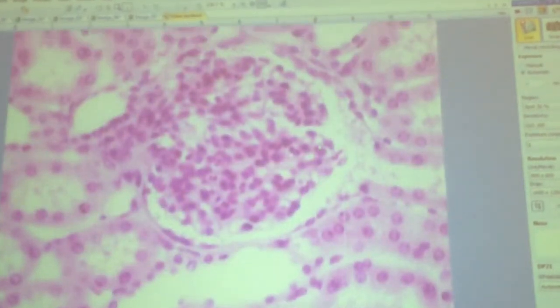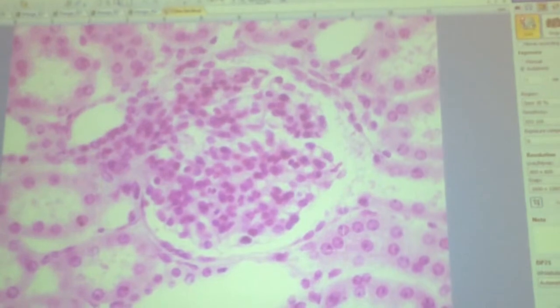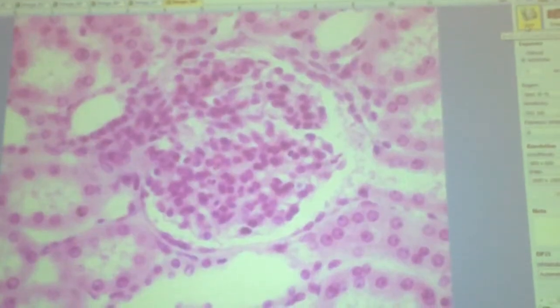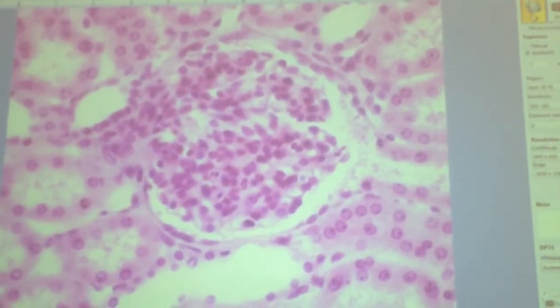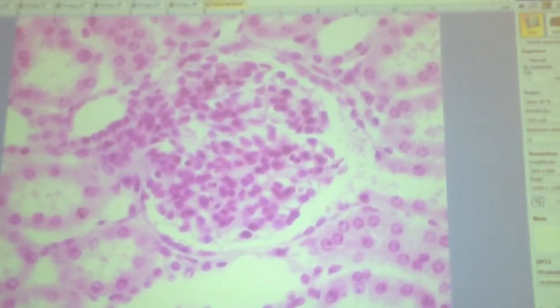Oh, here's another really good one. Yeah, this one's really good. I'll take it. Oh, Yanni, this is exciting stuff. These little glomeruli are working hard for you right now.